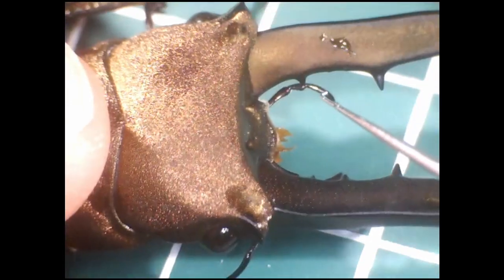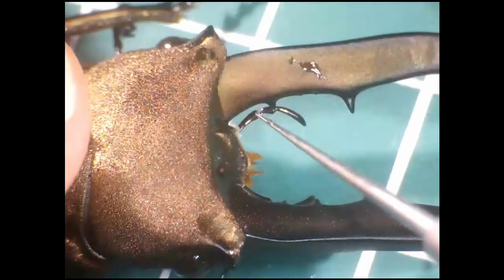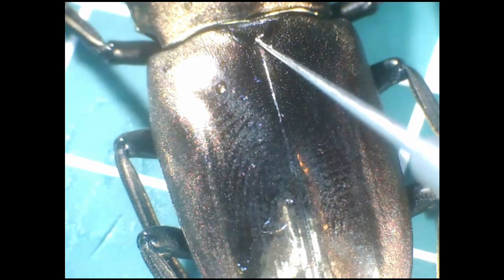Now let's move up to the most striking feature of any stag beetle — the antlers, which are present only in the males. These antlers are just modified mandibles, mainly used for wrestling other males. The other mouth parts are here; we'll see those later. Moving back down, we have the head, the pronotum of the thorax, and then the abdomen, which is a beautiful metallic bronze — hence the name of the species, metallifer, which is Latin for abounding in metal.